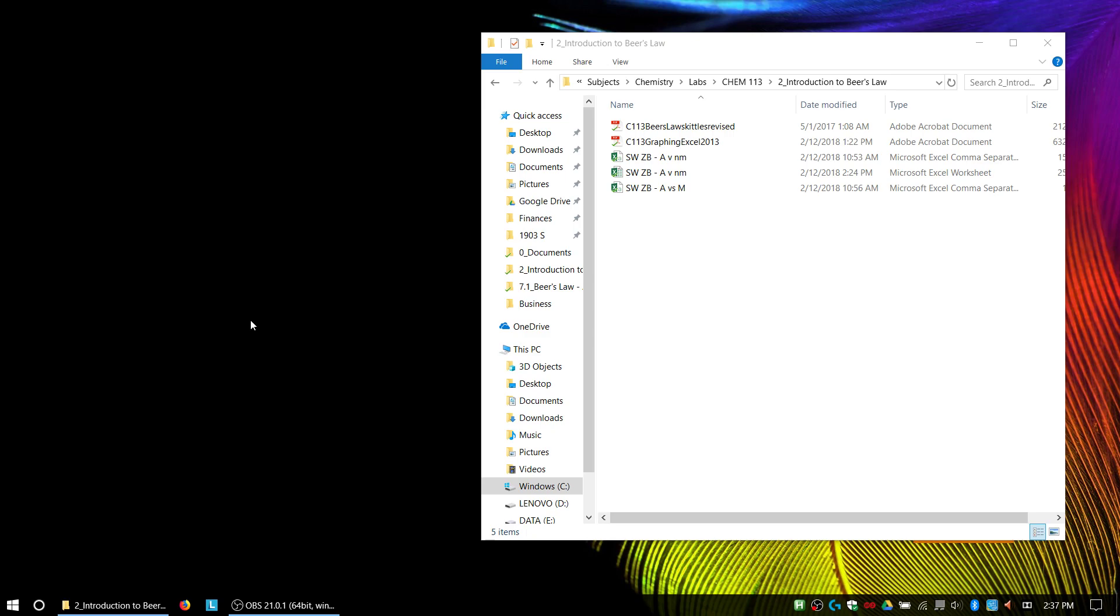Hey everybody, this is a video screencast to show you how to take your data from your Beer's Law Lab and put it into Excel and graph it.